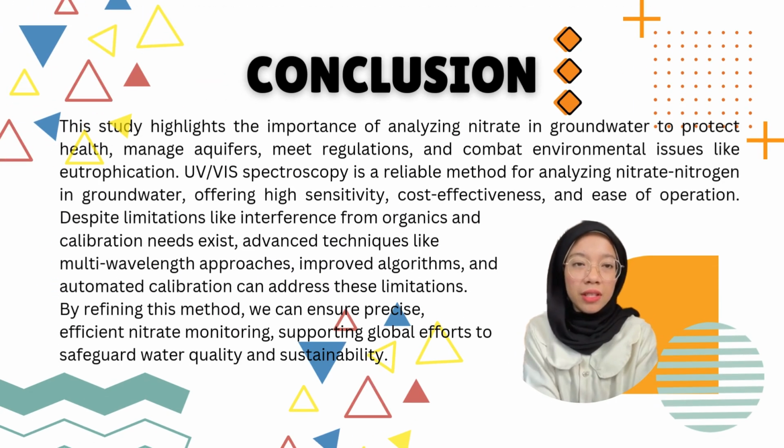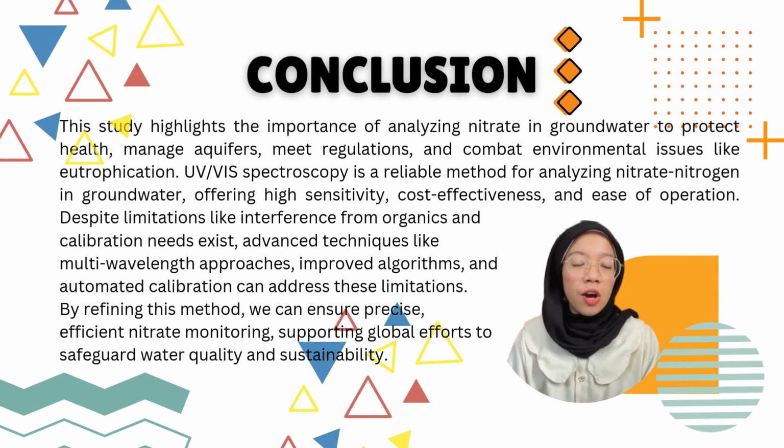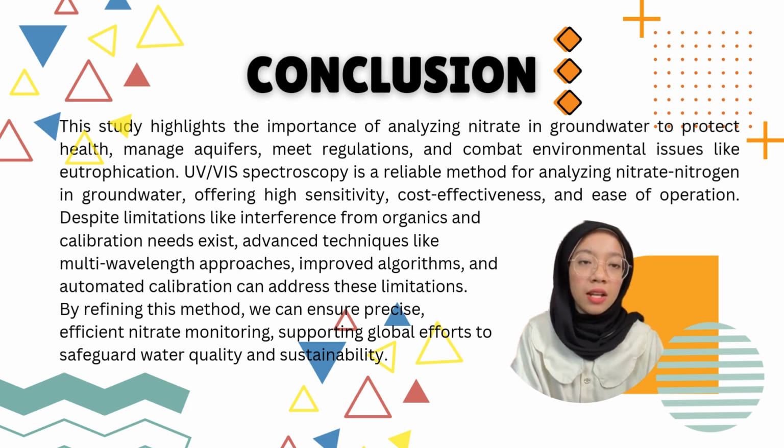In conclusion, this study highlights the critical importance of analyzing nitrates in groundwater to address health risks, manage aquifers, comply with regulations, and combat environmental challenges like eutrophication. UV visible spectroscopy proved to be a reliable, cost-effective, and user-friendly method for nitrate analysis.